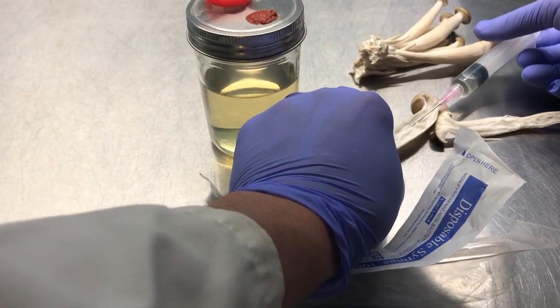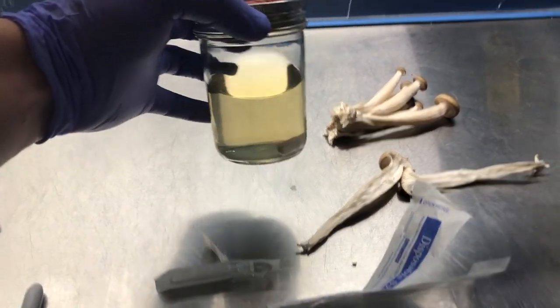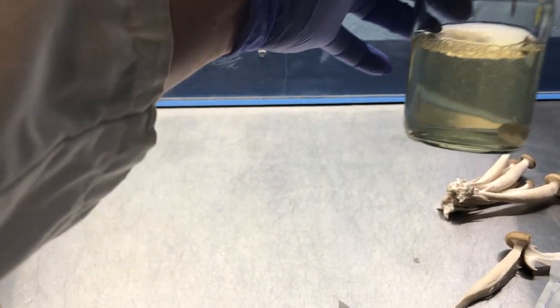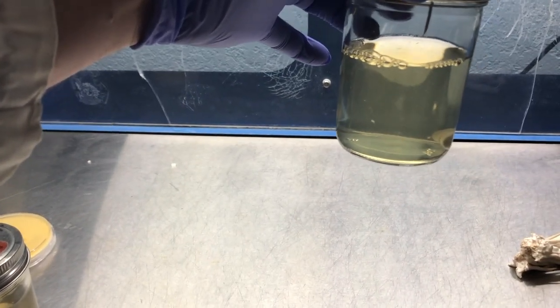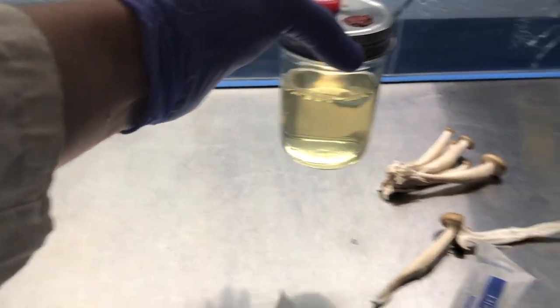So gather up some tissue inside that needle. And then we're gonna take, and you can see that piece floating around in solution right there. That's the sterile tissue from the needle biopsy.